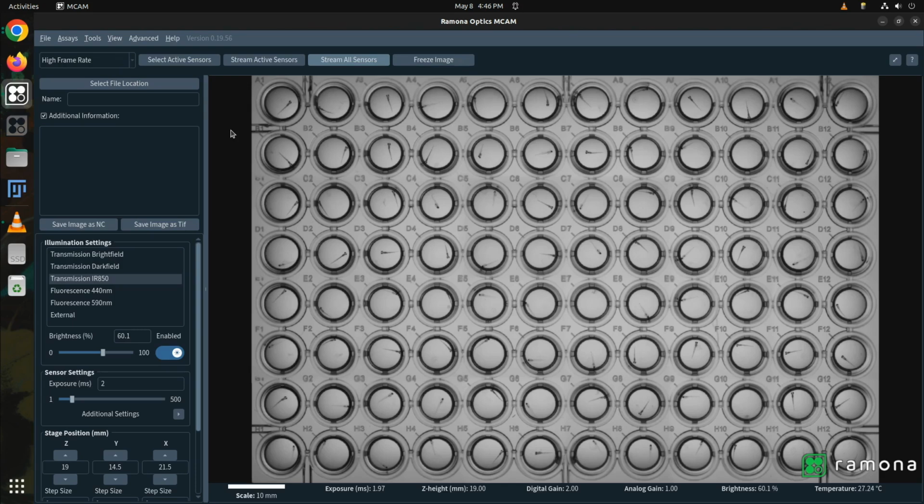In the vibration startle assay, we looked at how to acquire a video with vibration stimuli and all of the associated options. In this assay, we will skip over the discussion of the majority of the assay options and just focus on those important to the VMR assay. Also notably, because the duration of light phases in this assay can be significantly longer, we do not want to record all of the time between phases that we will not analyze, so we can acquire this recording as a video time-lapse. This will help us decrease the data size we are saving and the processing time required to analyze the data. It may be a good idea to review the vibration startle tutorial before working through this example.